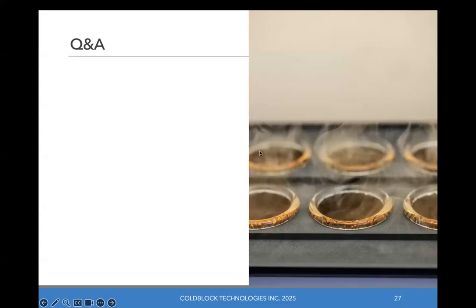Okay. Do you have any studies on copper concentrate samples? Sure, we do. I'll get lots of questions on the geochem side here today, which is great too. Yes, we've done a fair bit of work on copper concentrates. A number of the large global commercial labs have done work on copper concentrates and have developed copper leaches that are very fast. You'll see on our webpage a number of notes that are there. Again, 15, 20-minute digestions there for concentrates.